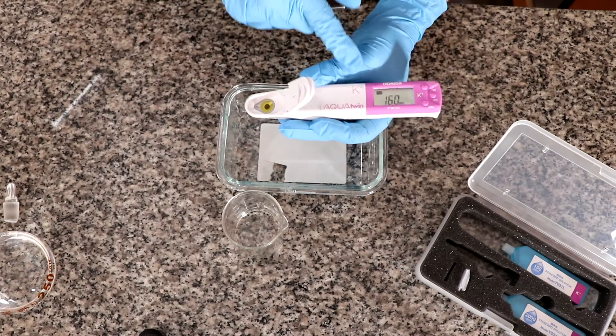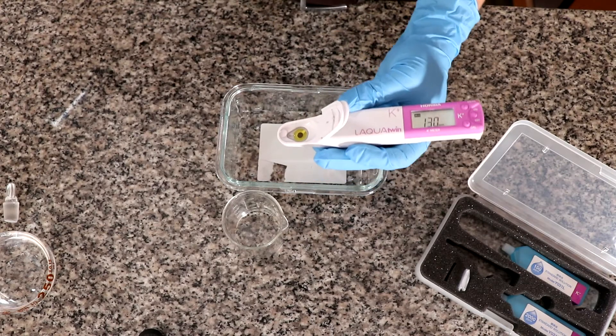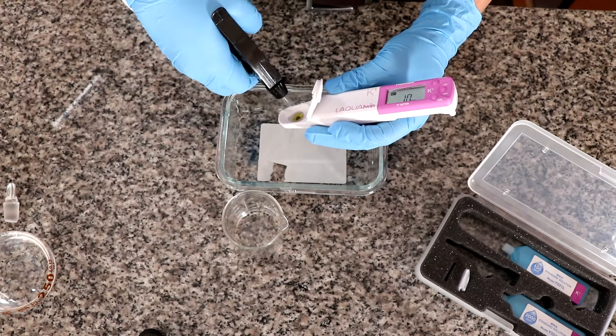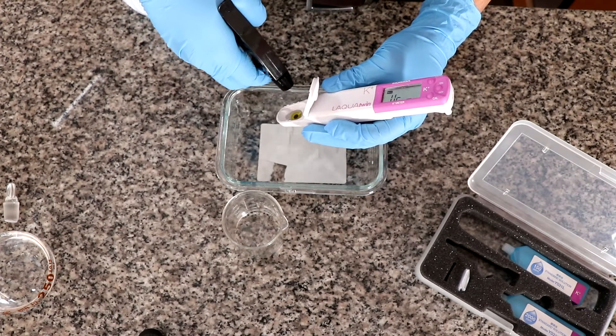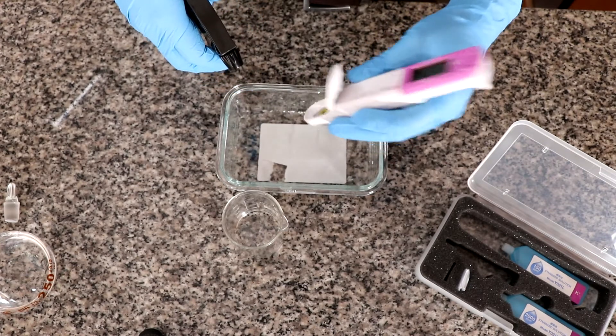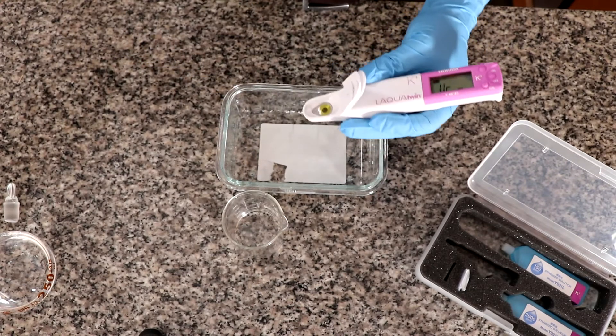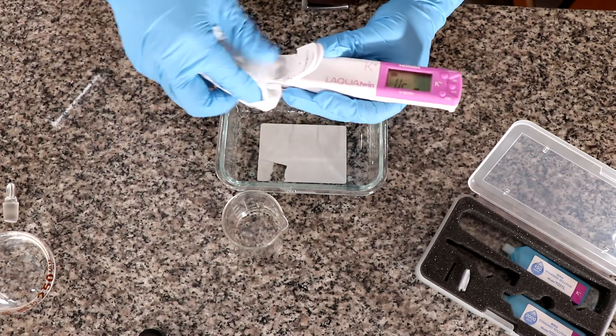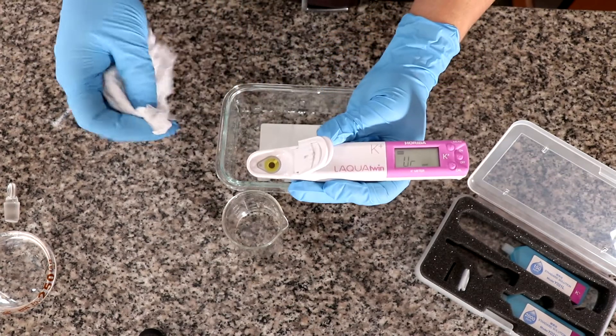The error of the sensor is going to be plus or minus 10 percent. So that is what we would expect from it. The manufacturer probably put a little bit more potassium in the fertilizer than it says on the label, which is pretty normal, even though they want to guarantee that they're always above the analysis.